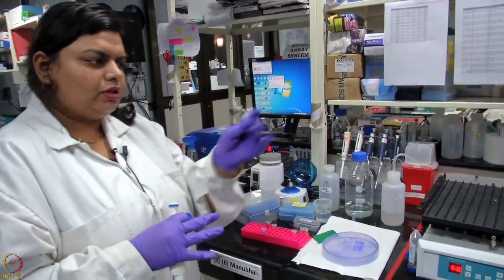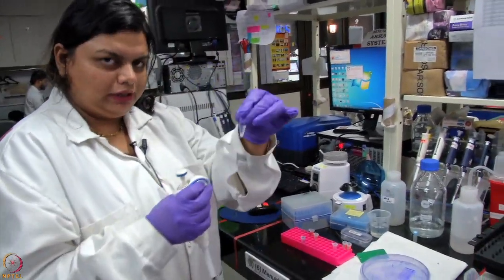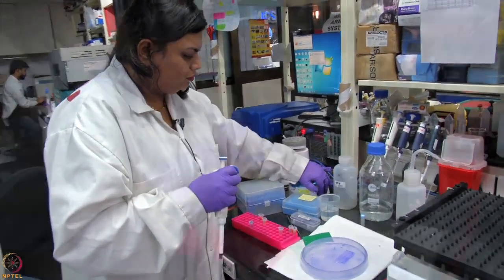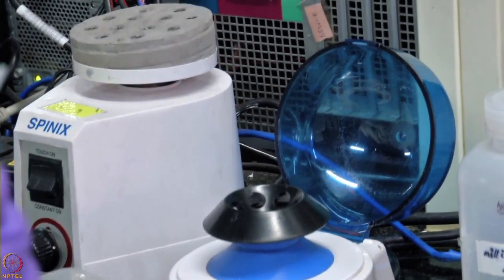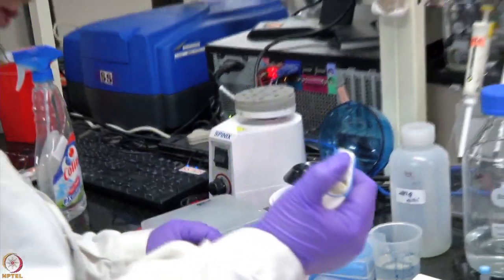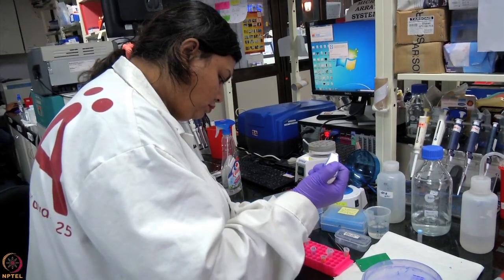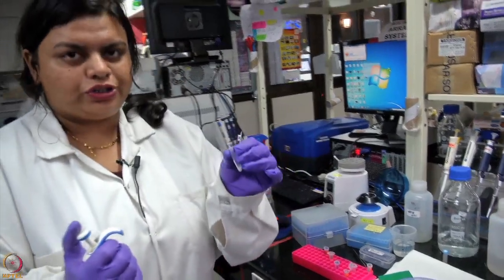So what we will do is we will discard the flow through, we'll give it a brief spin. We'll store the flow through in a separate tube. And now we'll perform washing.